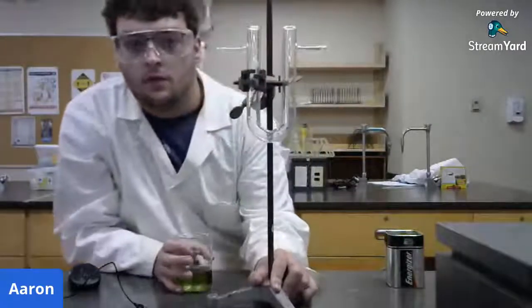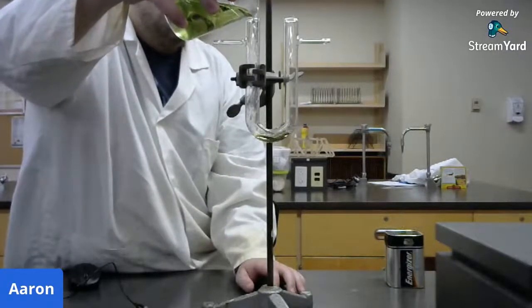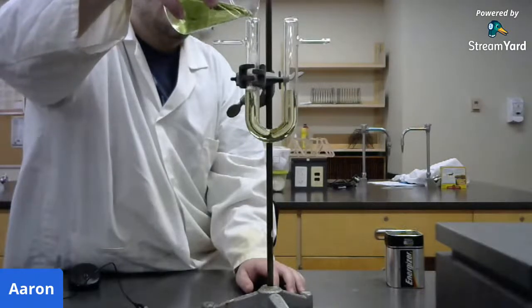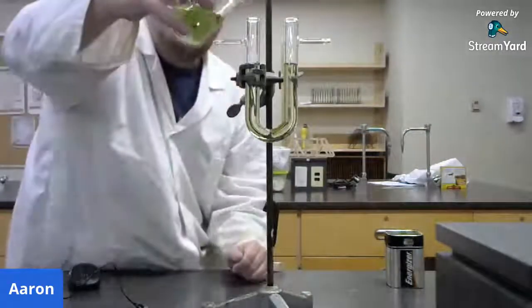So I'll set up the U-tube here, and I'm just going to add our salt solution to the U-tube. Coincidentally, I'm playing with the U-tube on YouTube, so.